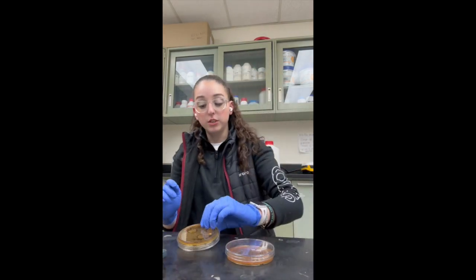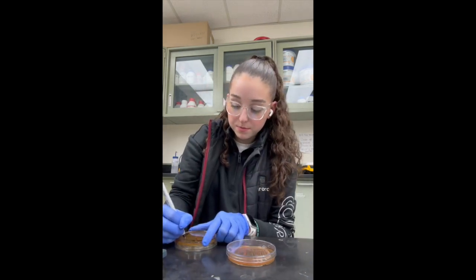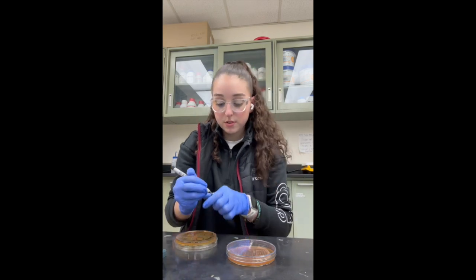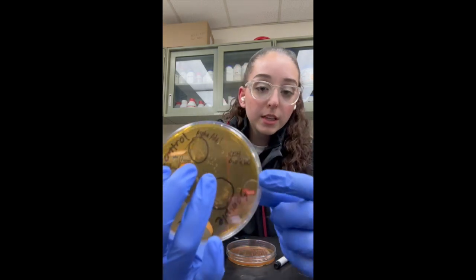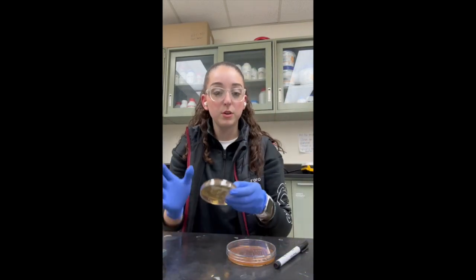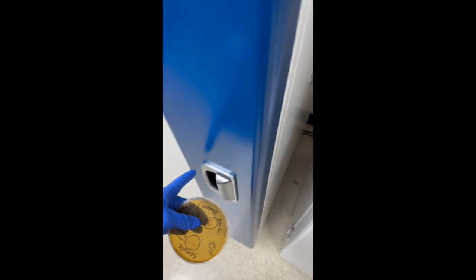I'm also going to make sure I clearly label it that it's mine. Okay, here's my label, KDH, Bio 260. And then I'm going to go put that in the 37-degree incubator right over there.